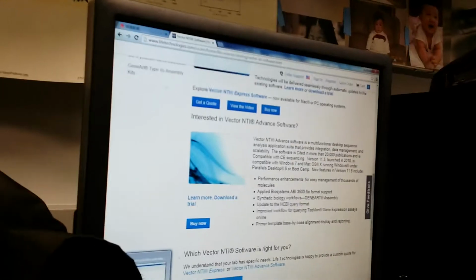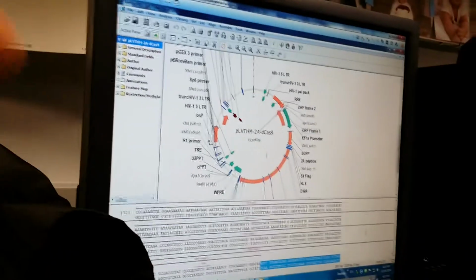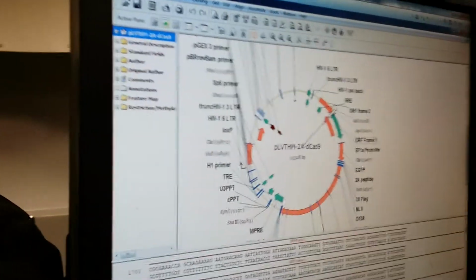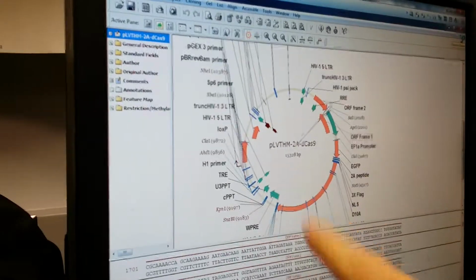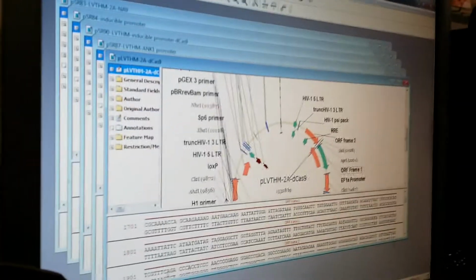Now, our department IT guy built two systems for me. This is the new system, and this is the old system. Can you explain some of this one? Explain what? Like, I see lots of plasmids, and where do you put your gene? Okay, let me show you.